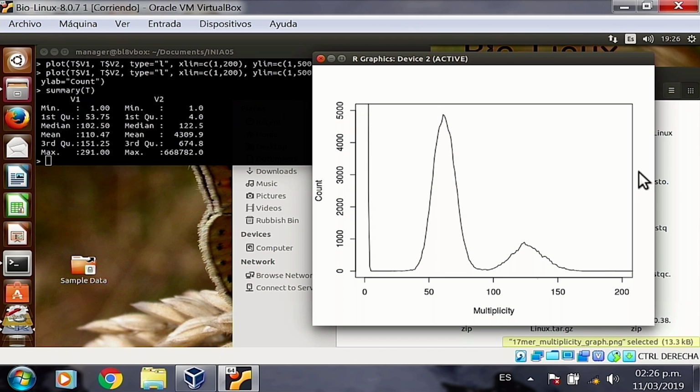In some cases where we've done a very shallow trimming, you will see that your peak approaches that 600 number. When we've done a more thorough trimming of the data, for example, in my case, the number reaches around, it should be around 60.